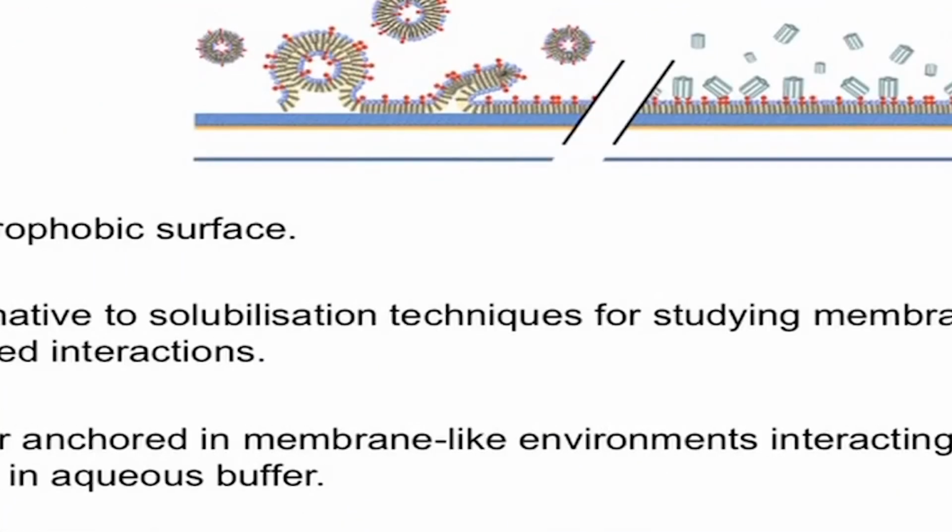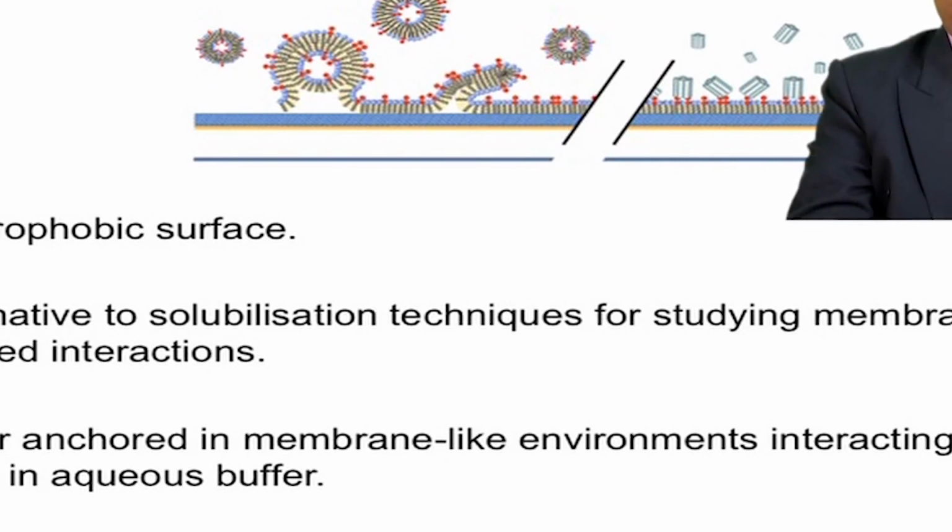Another very important chip surface is HPA. These are flat hydrophobic surfaces, and they are useful for membrane associated interactions. Receptors are generally anchored into membrane-like environments, and then they are useful for interaction with analytes.